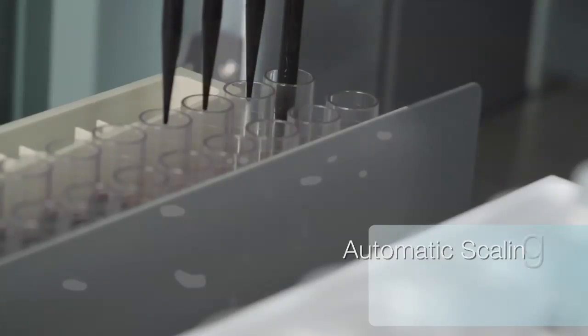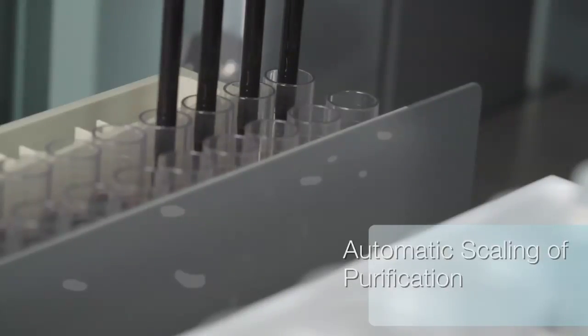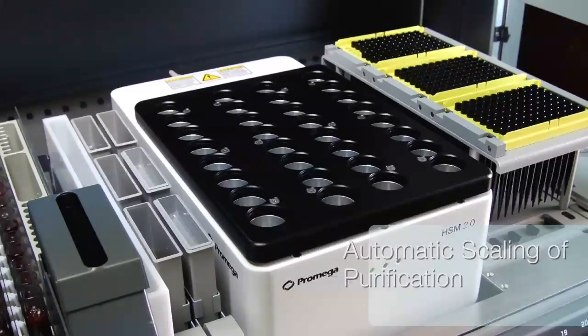Reagent lot numbers can be scanned for record-keeping purposes. The system calculates reagent use for each sample, ensuring best results while minimizing waste.